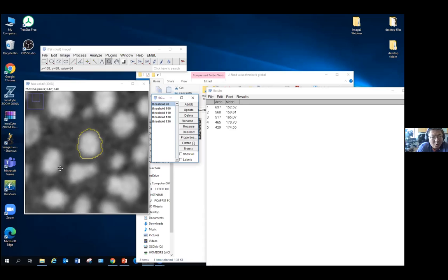It's not important how good your result is on a single image, or what your subjective view on what the image tells us is. The important thing is always whether you can find a fixed value for the thresholding and fix the steps, the protocols, on every single image, so we use the same steps, same process, across all the images.